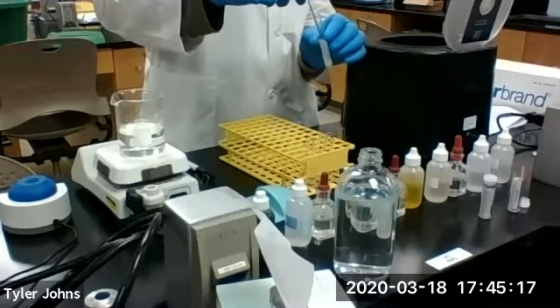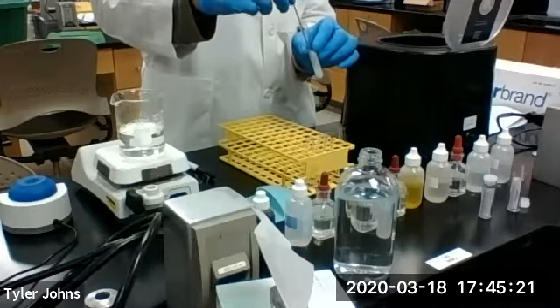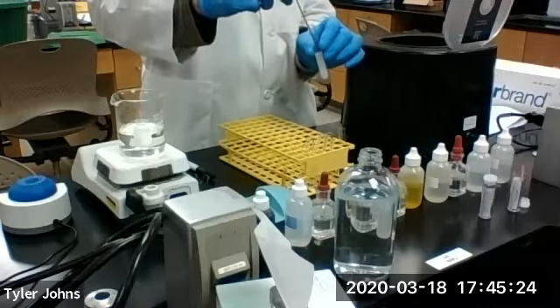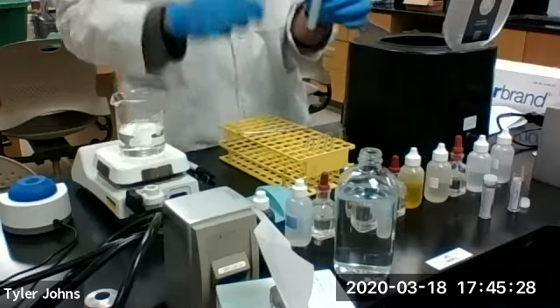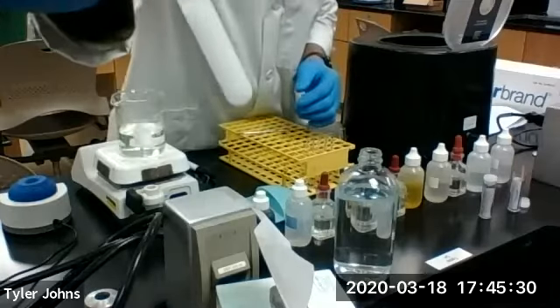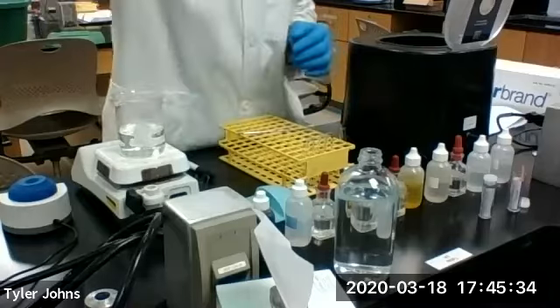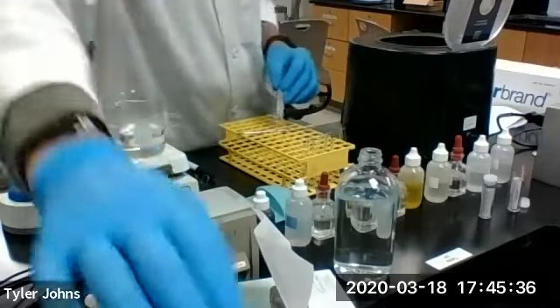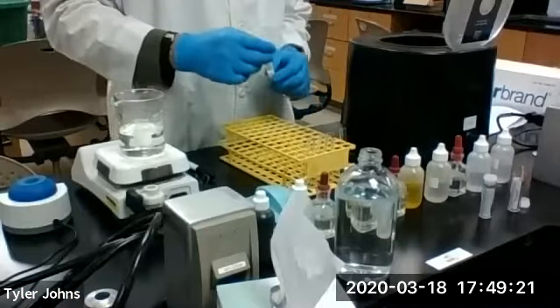But as you can see, a white precipitate of magnesium ammonium phosphate hexahydrate is a preliminary indicator of the presence of magnesium ion. You can see we're already getting some white precipitate. Okay, it's now been 5 minutes.